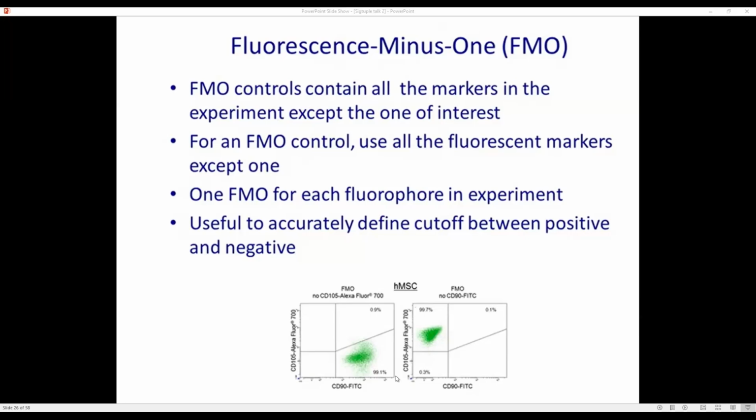Now coming to the second part of your question. I've generated a compensation matrix for my 10-color machine. Can I use it for a 4-color experiment, 5-color? Yes, you can use it because you have compensated the spillovers across those fluorochromes. So even when you use a 4-color experiment, it isn't going to create any problem.